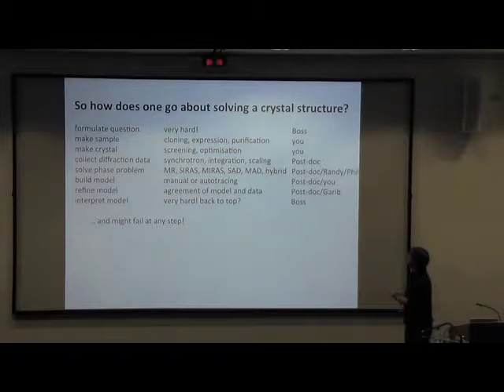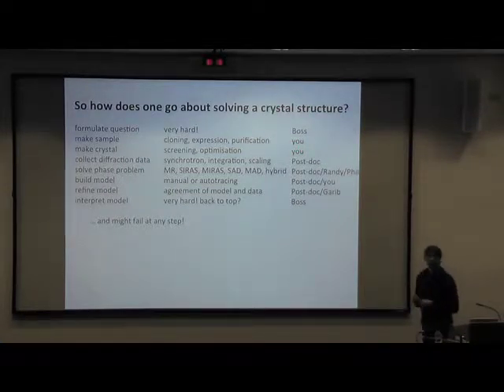You have no clue that 2 other people already spent 2 years doing that and didn't work, so you have full optimism. And then they let you fill in the lab for a long time. Then you finally get those crystals. You go to a synchrotron, you have no clue what you're doing. And so there's a postdoc who'll probably collect the data for you, and if you're lucky, you may collect the data set as well. And then you need to phase it, and again, the postdoc is going to help you.